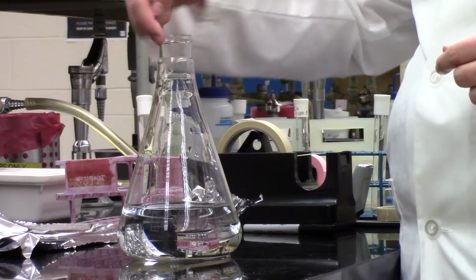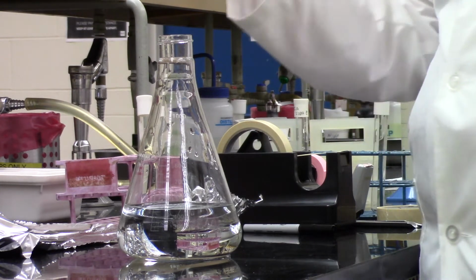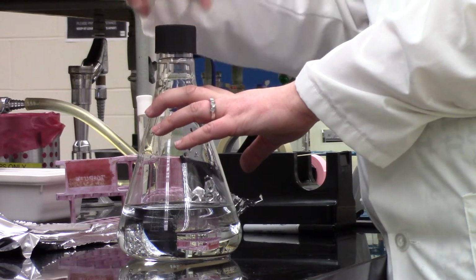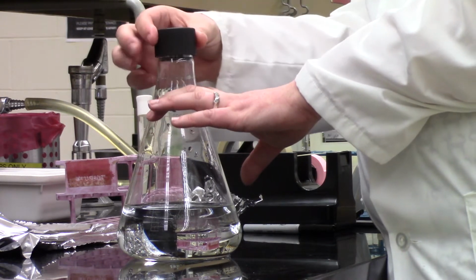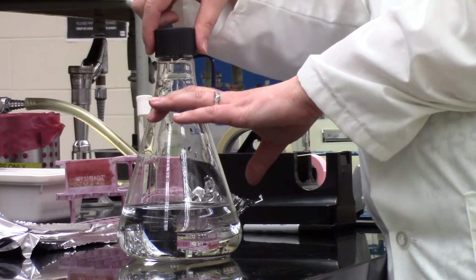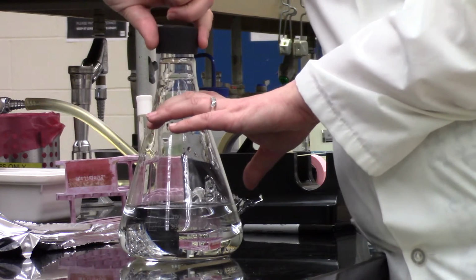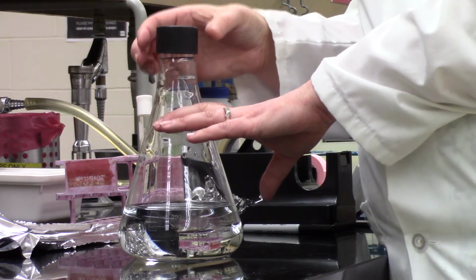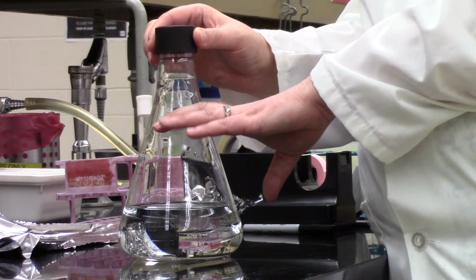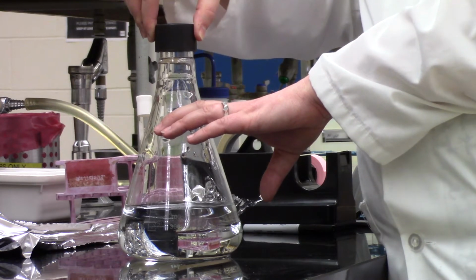is a lot of these have kind of a screw top to them. And for those, we actually have caps to put on. So for the caps, you would screw it down, and you've reached the point where it's now tight. And once you've gotten to that tight point, you actually want to undo it 1/2 a turn. So once you've unscrewed it by 1/2 a turn, you'll notice it can wiggle up and down, but even if I pull quite hard on it, it's going to stay in place.